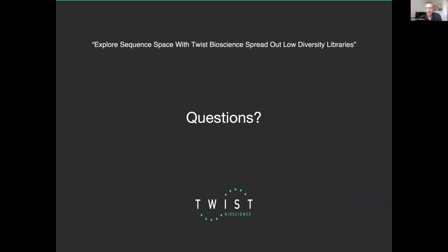Okay, how can I avoid motifs that are known to cause issues for developability? There's a few great papers out there that talk about these developability issues and what motifs to avoid. Typically, if you want to avoid those motifs, you have to be really careful when it comes to designing the libraries, right?